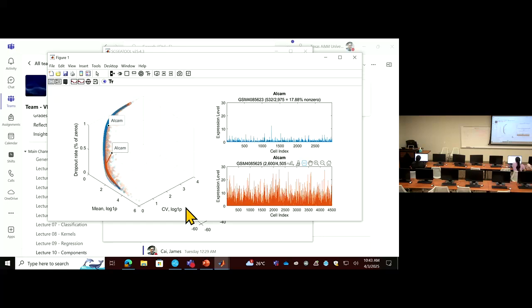I have this one. You download this one already in there? I do have it. These two, yeah, it's here. This one here. So you can just run analysis DV with these two samples.